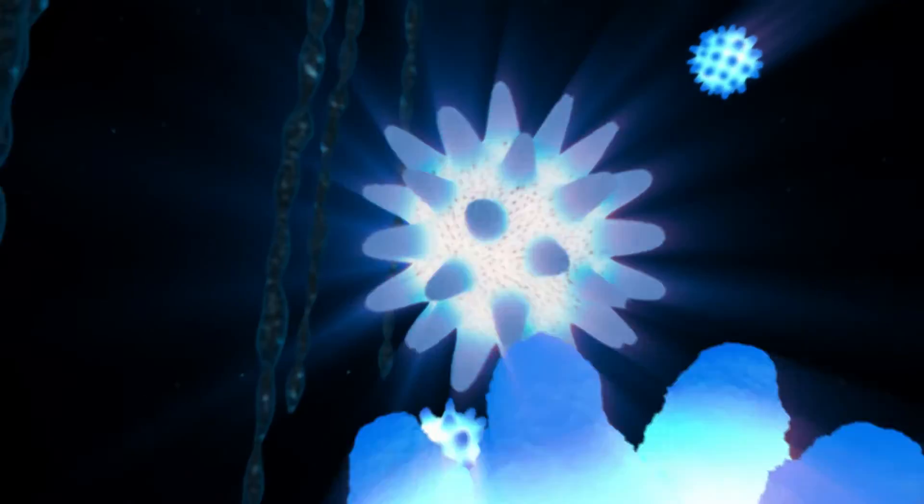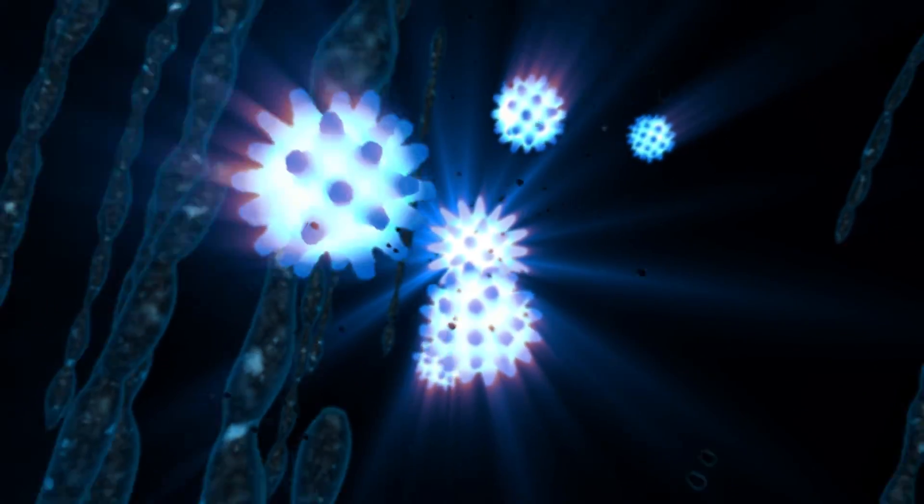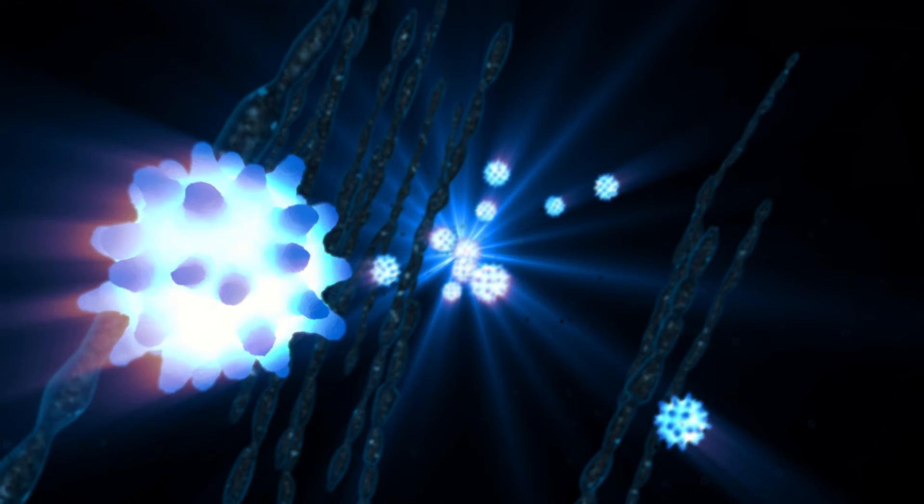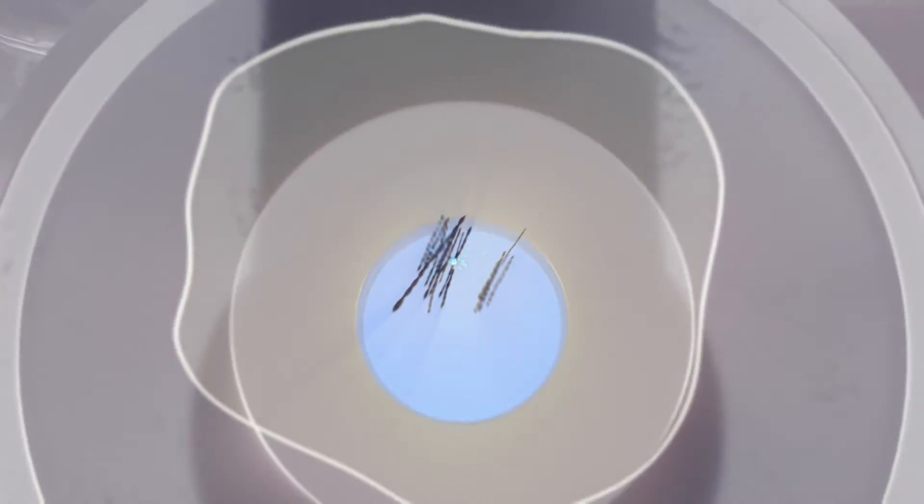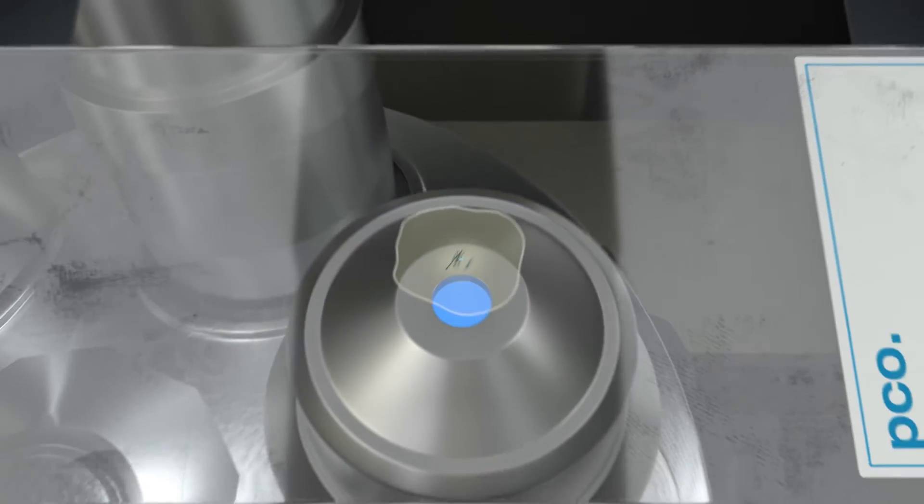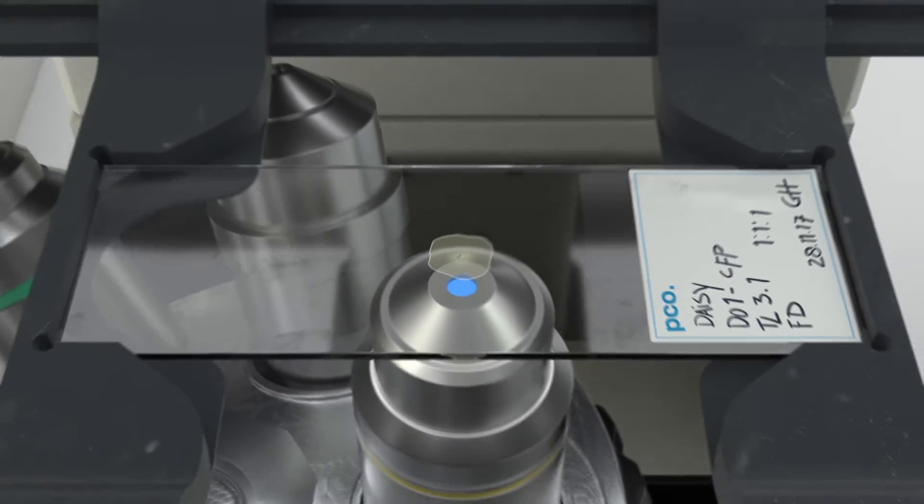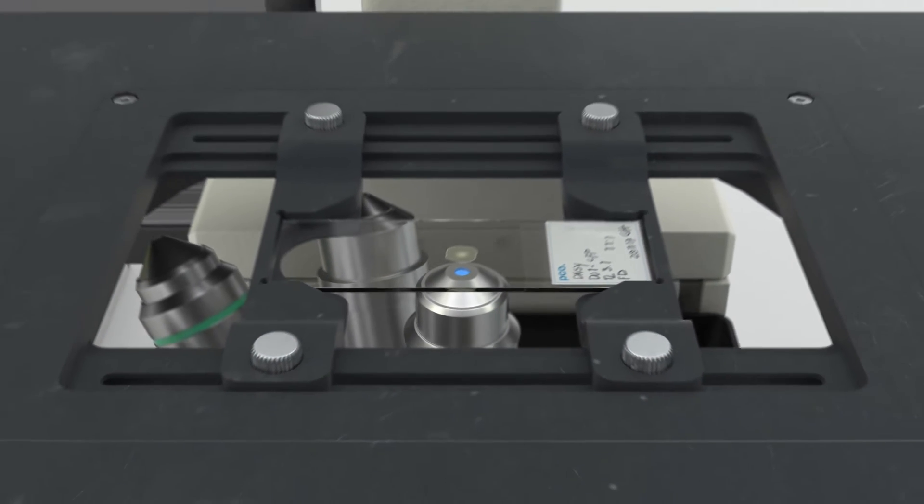Fluorescence lifetime imaging or FLIM in the time and frequency domain. The differences in fluorescence lifetimes in luminophores can be used as an imaging technique called FLIM. This can be achieved both in the time and the frequency domain.